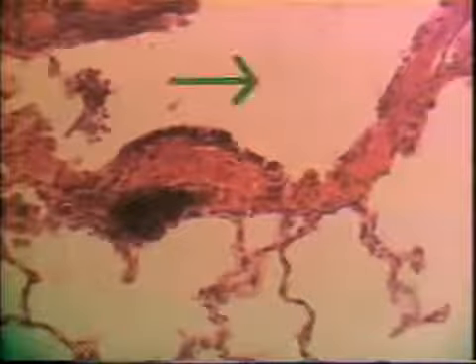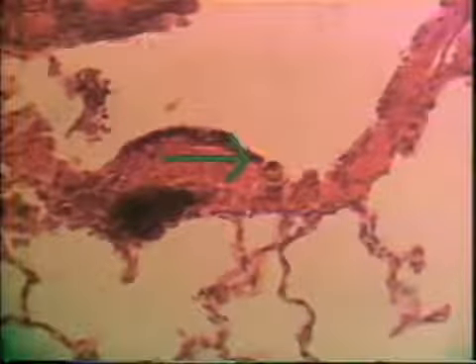Three important characteristics of the terminal bronchiole: an increase in smooth muscle. You can see that here in the wall. There's a simple ciliated epithelium, and we do not have goblet cells. Now, I want to show you a higher power of that. This is the lumen above of a terminal bronchiole, and notice this is a simple columnar epithelium. It has cilia, but there are no goblet cells. And notice this bundle of smooth muscle.